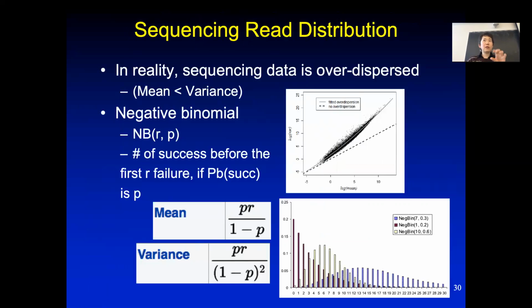And so we use all the genes to estimate the trend or at least the distribution. And based on your observation, it adjusts a little bit, right? So if the original variation is too big, it will try to shrink. But if your raw data variation is too small, it will try to increase a little bit, just so that the variation is not 0.